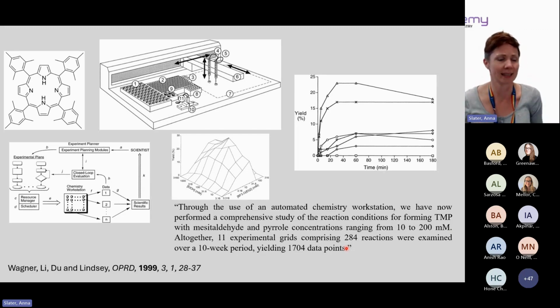It's not. It's an excellent experiment. It really does show you that you can change a lot of different conditions. You can influence the outcome of this reaction, but maybe you've just reached the maximum, you might think. But I think this comes back to Annabelle's point as well. You might just not be looking in the right part of chemical space.